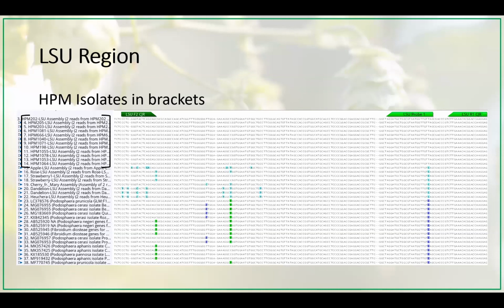The real issue here is both with cherry powdery mildew and strawberry powdery mildew. The SNPs aren't really conserved between them, so where I might find specificity for cherry powdery mildew, I'm most likely not going to find it every time for strawberry. So that was the one SNP that I've slid around a little bit more, but I've also done some other designs in some other places, yeah. Okay, thanks.